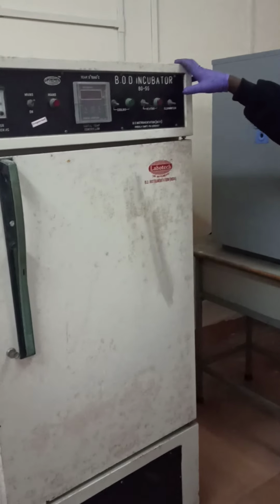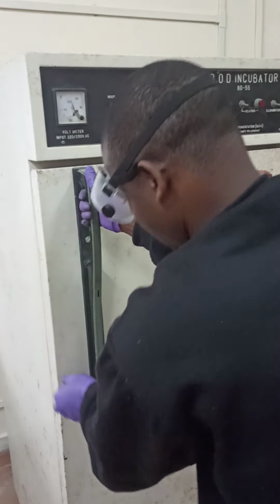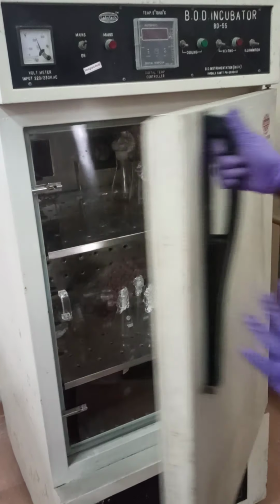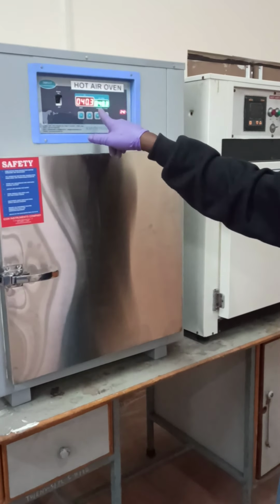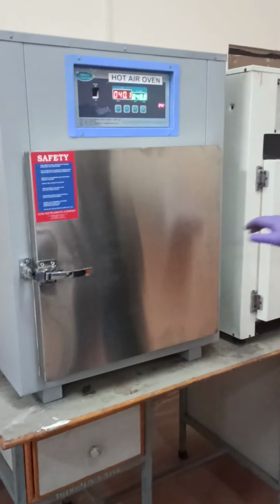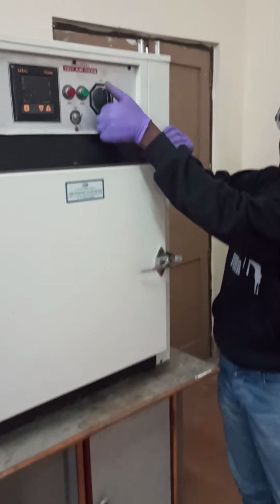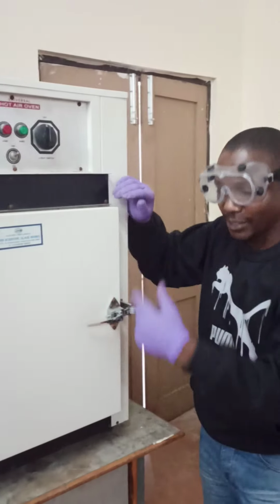I am having the incubator, very useful one. This is mine. It does not belong to somebody. It's within my labs. You can find some of my samples are there. This is the hot oven, digital one. Within it, you'll find some of my samples. I'm having the hot oven, the manual one, which I can adjust accordingly. This is not digital. This is the manual. So I'm having both manual and digital.